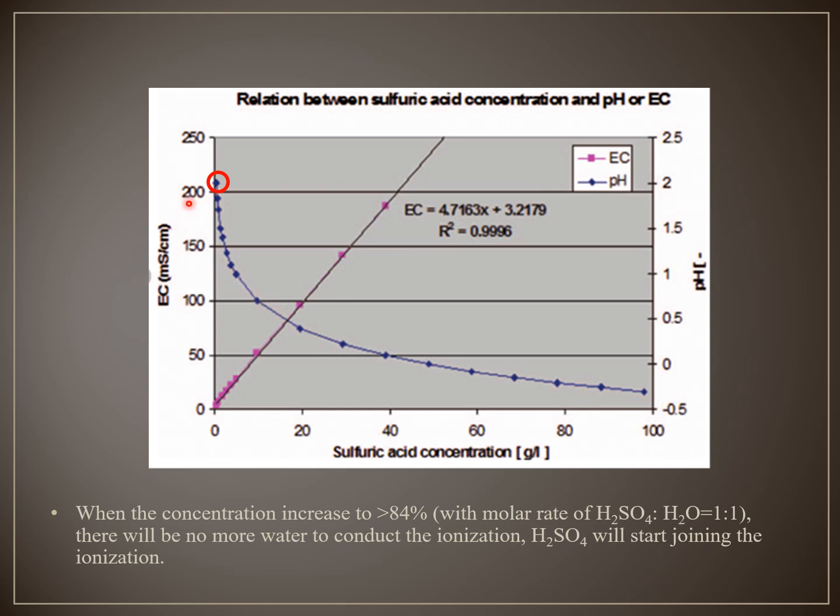Let's see, when the sulfuric acid concentration changes to higher, what is the relationship between the pH meter's pH value and the sulfuric acid? Most of the time, it's not a linear relationship. So it's better not to use pH value as an indicator for determining the concentration of sulfuric acid, because the suitable range is too small.